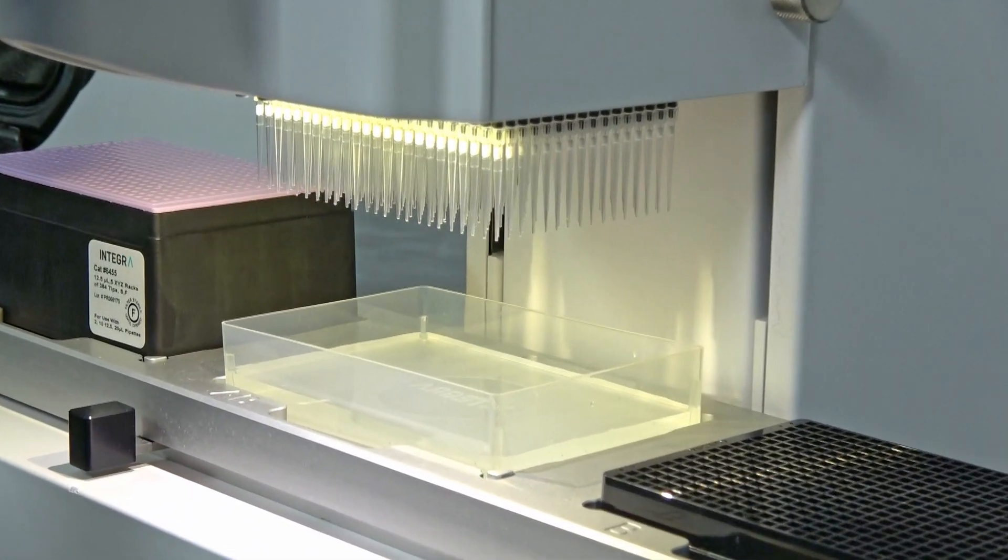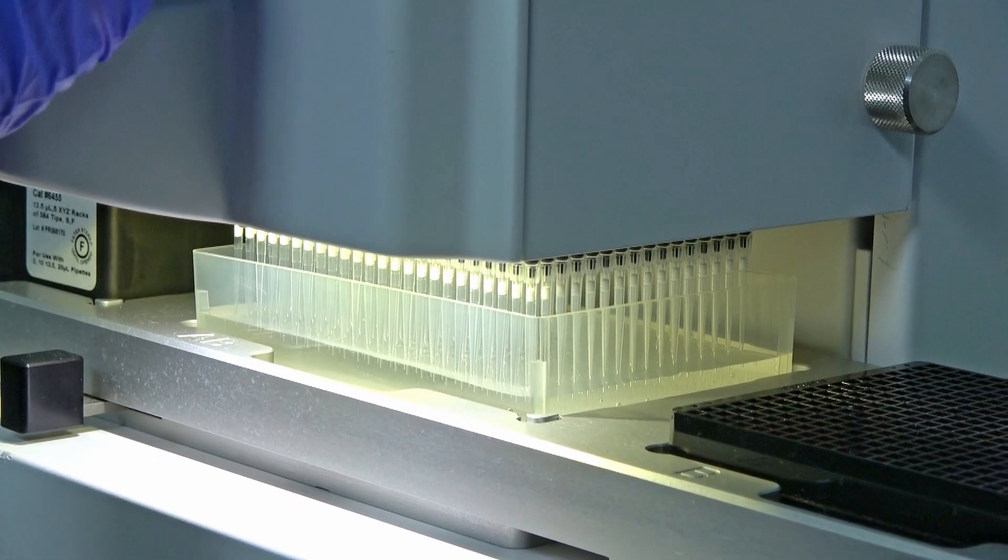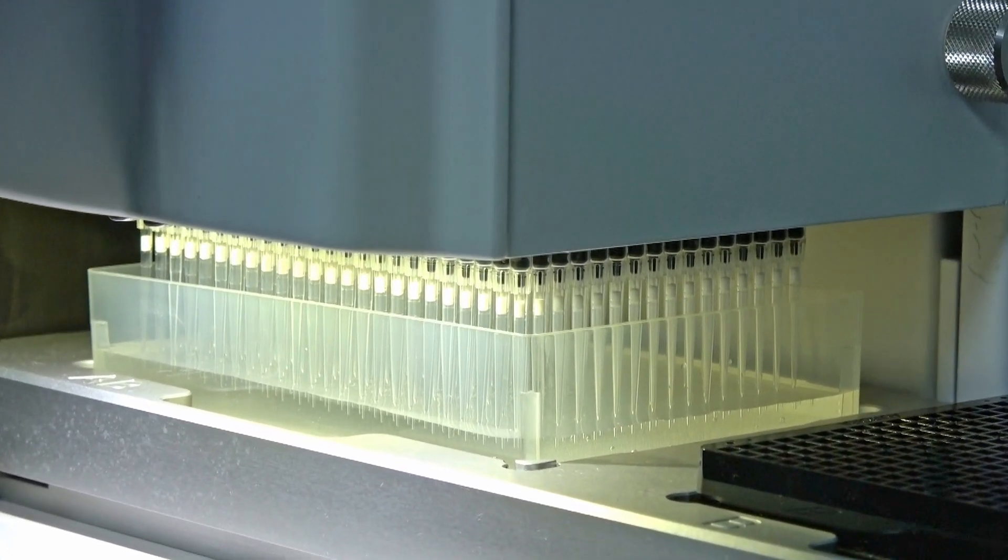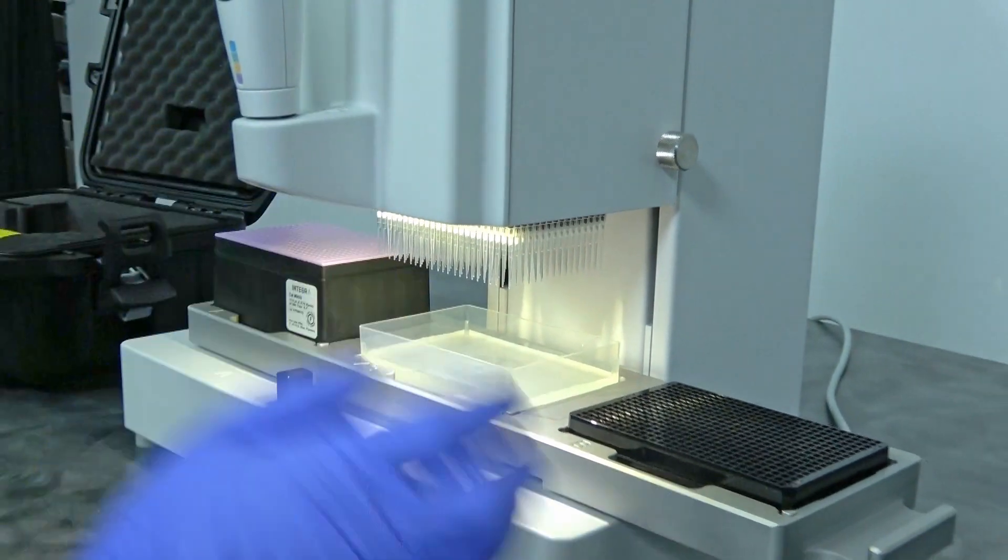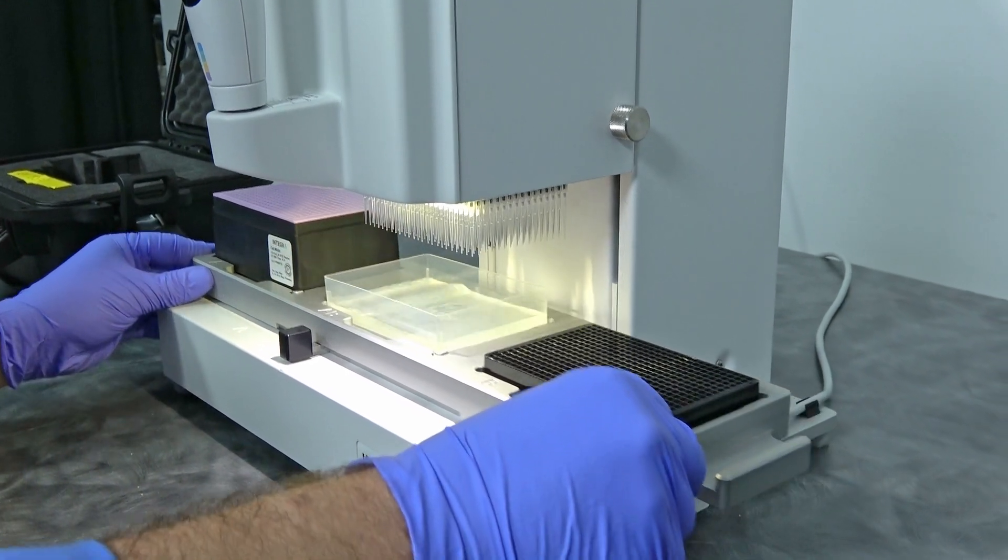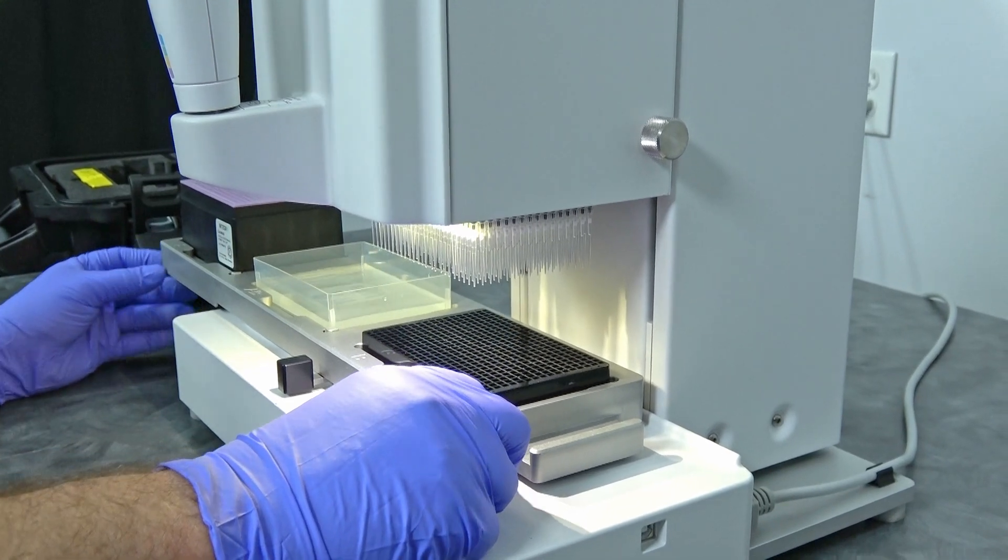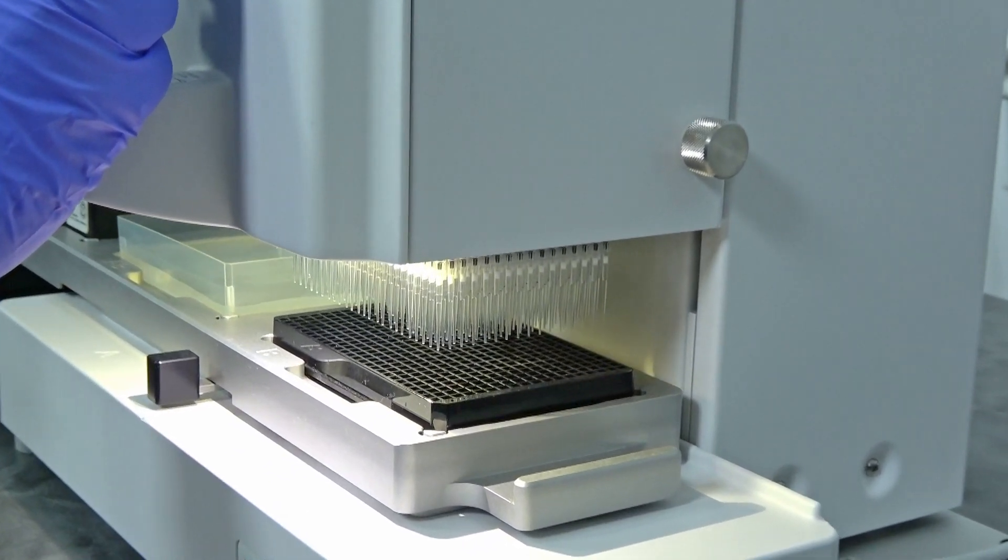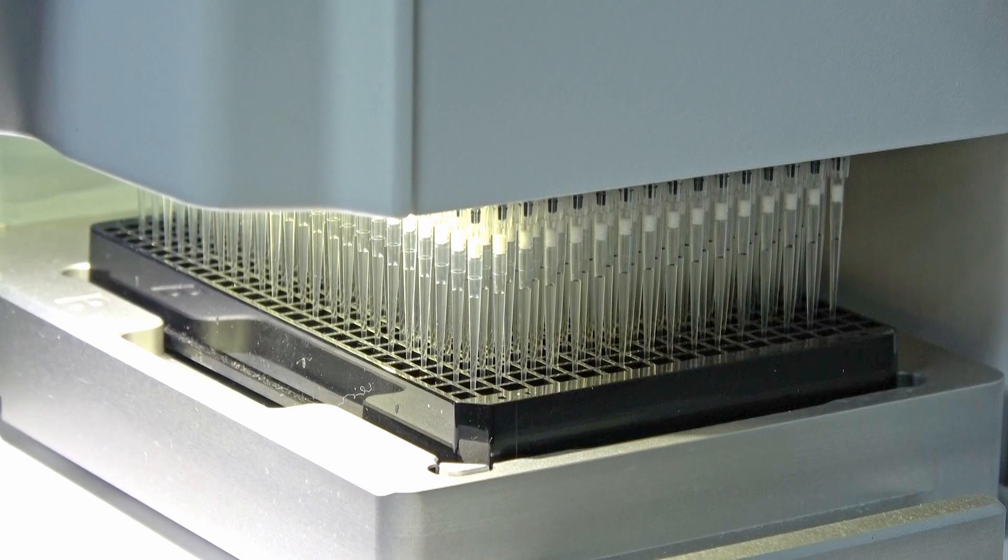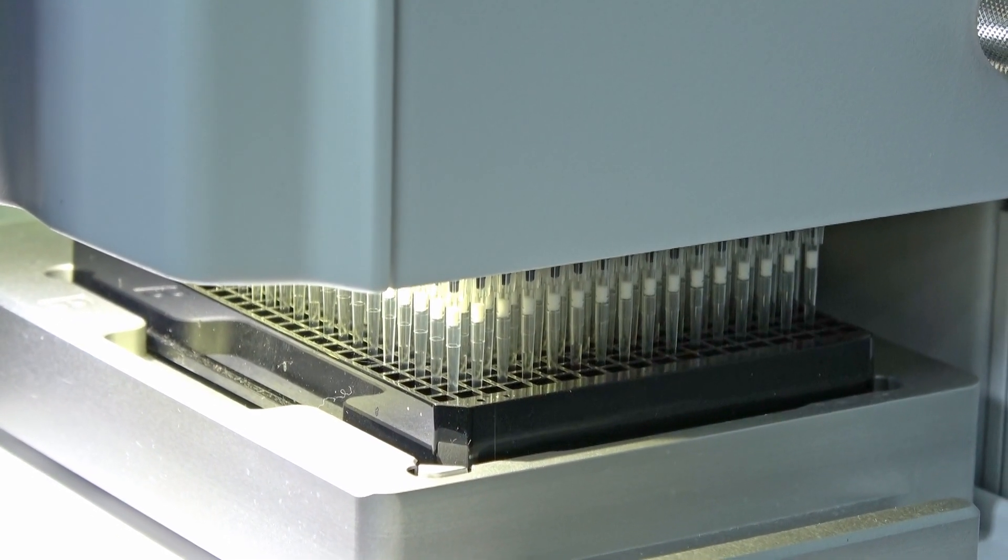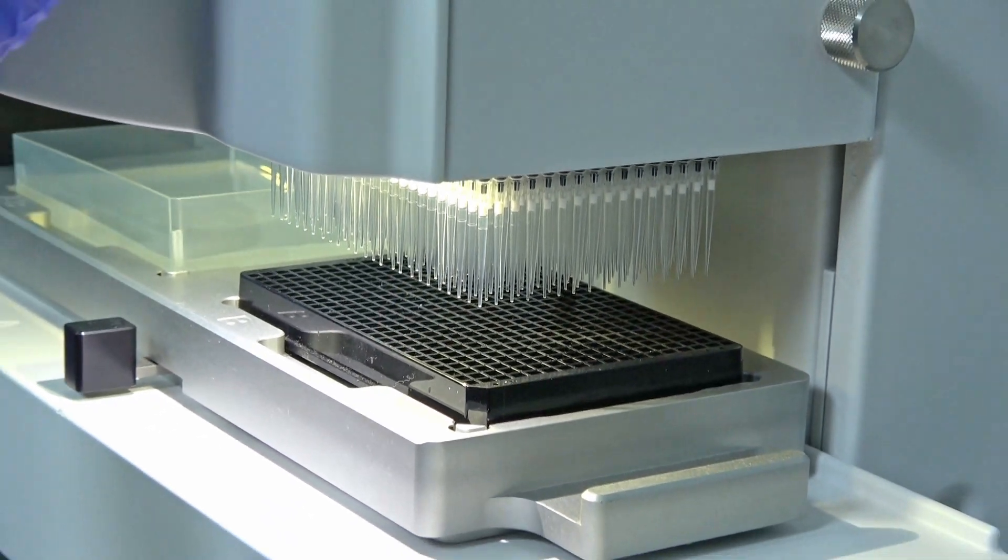So you're going to come down now and you're ready to aspirate some fluids. And once you get it down, all you got to do is hit the run and it's got us 10 microliters there. We're going to just lift it straight up and we're going to slide over to the microplate, lock it in, and then we're going to come down and we're going to hit run again. And you can see it dispensed everything into the wells.